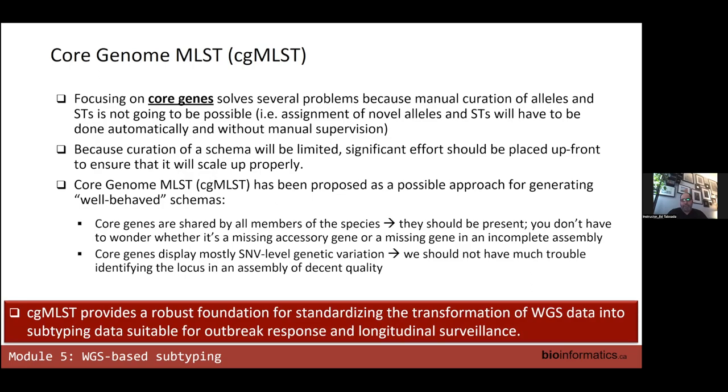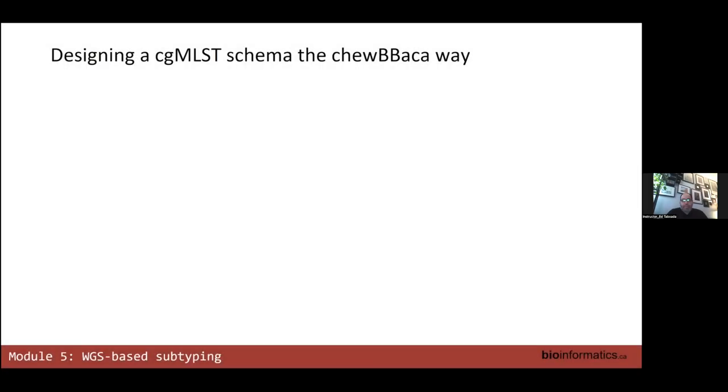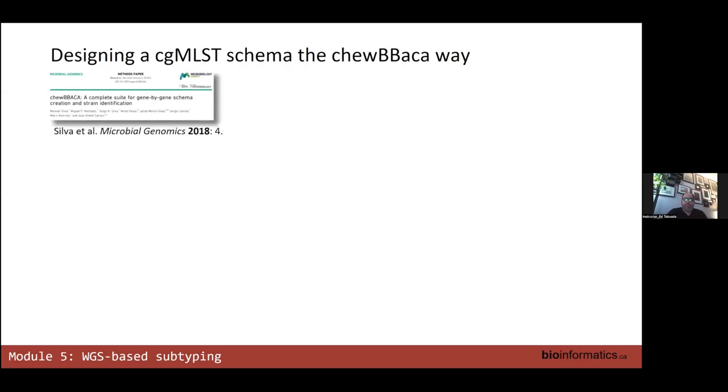for genome-based typing. Now, in terms of designing a schema, I'm going to talk about this particular software that was developed by some colleagues in Portugal called chewBBACA.